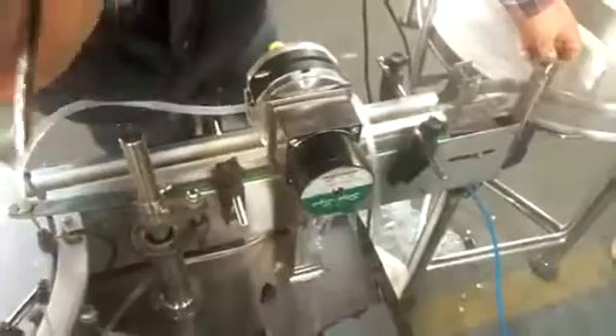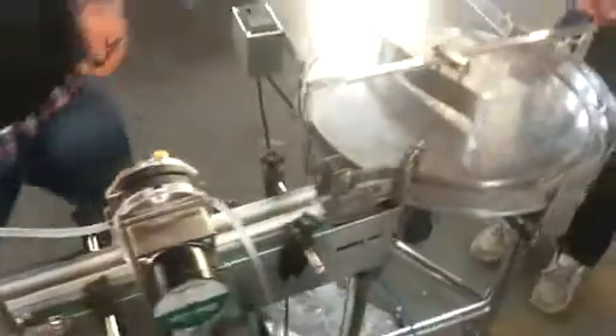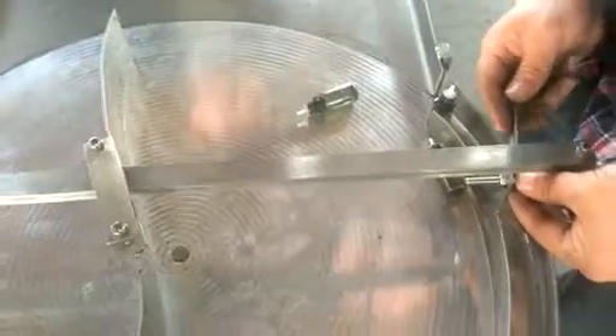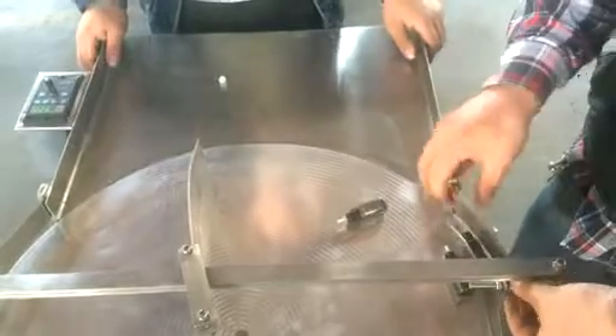After that, we should go to the bottle feeding part. We unscrew the bottle feeding part that we already adjusted for 30ml. Now we are changing to 15ml.